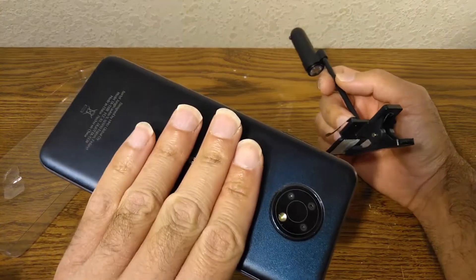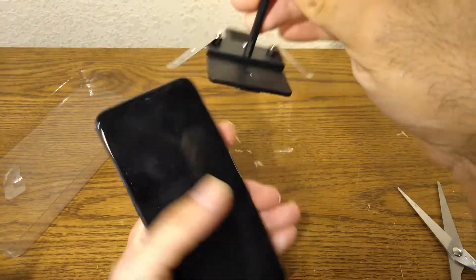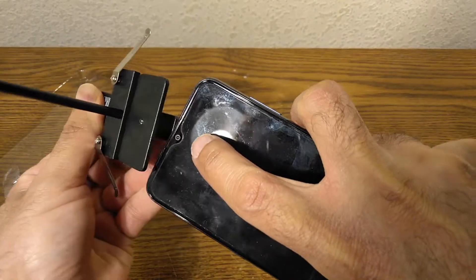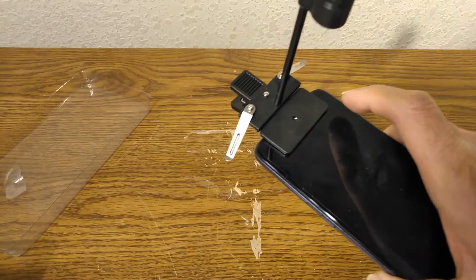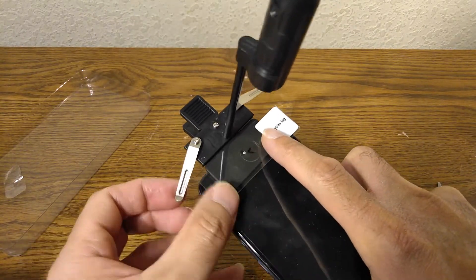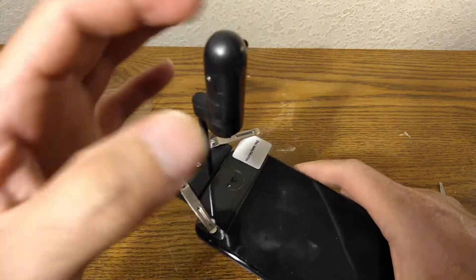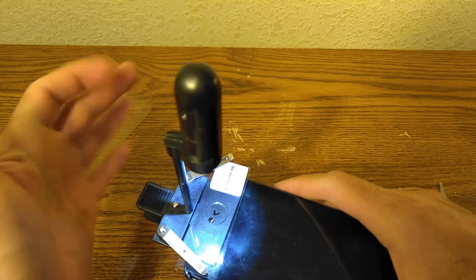Okay folks, so here's the phone. All you have to do is put the lens over here at the front and align that hole — this lens right here — to the front camera. Make that alignment, then put your slide over here and secure it with these tabs. Once you've done that, you just push the power button and it'll light up and you can see everything.